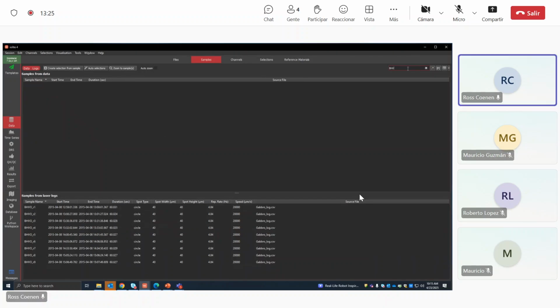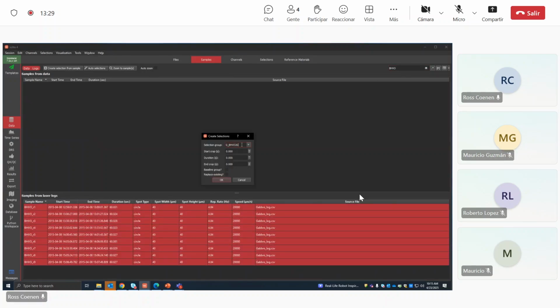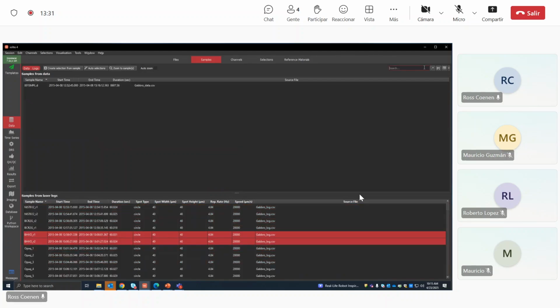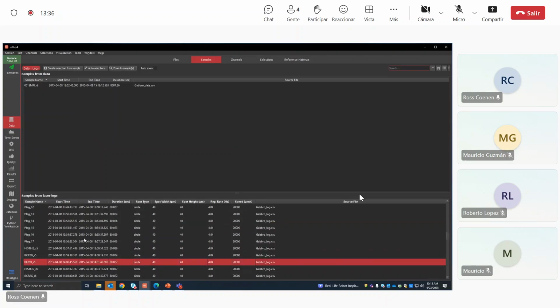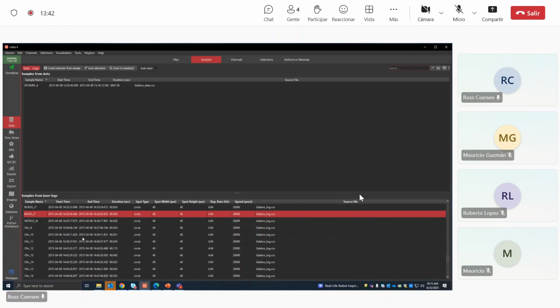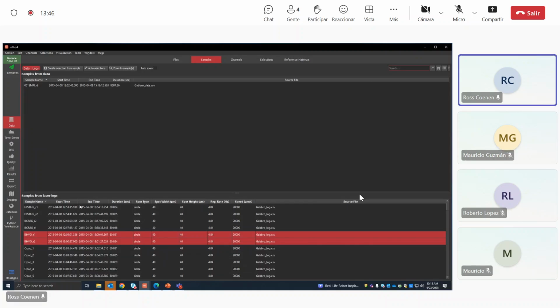Do the same with BHVO. So now we have all of our reference materials selected.